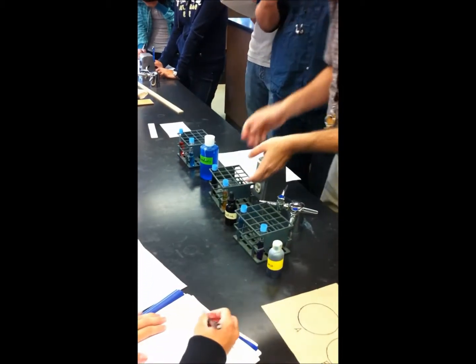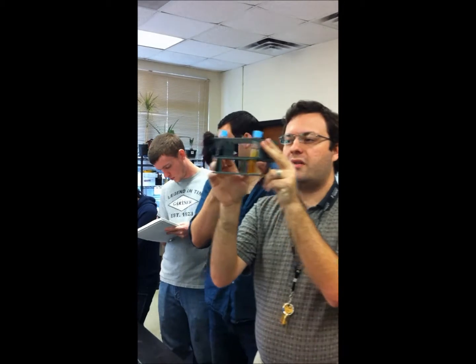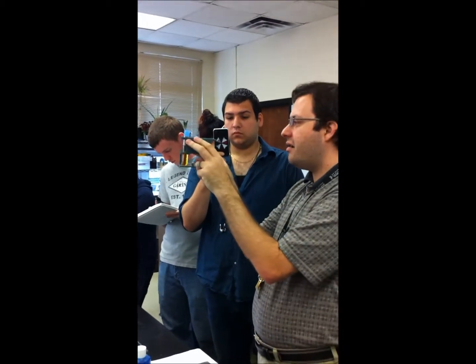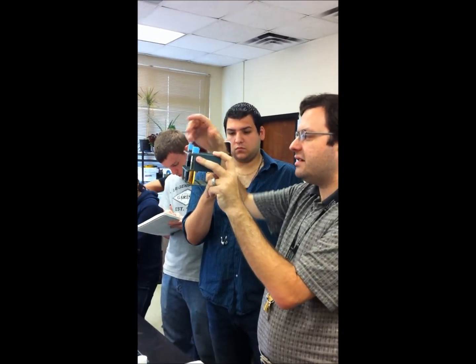They also may give you a set of test tubes. One of them will have the reaction that's not gone, and then the other one will have a reaction that tests positive. So this would be a negative test, this would be a positive test for which one?